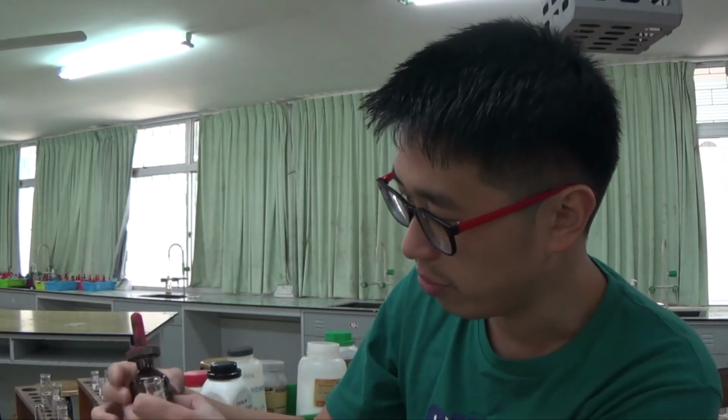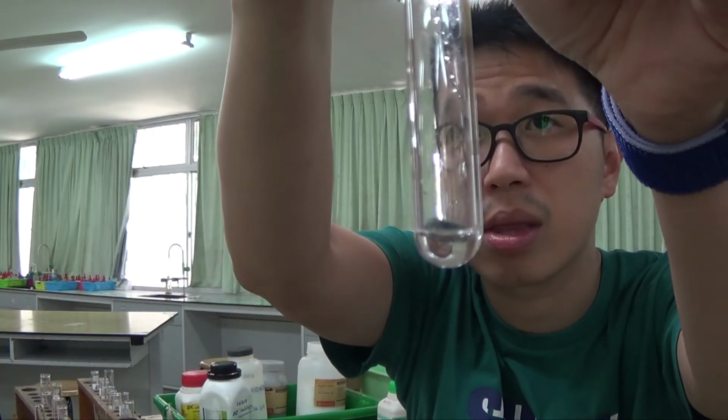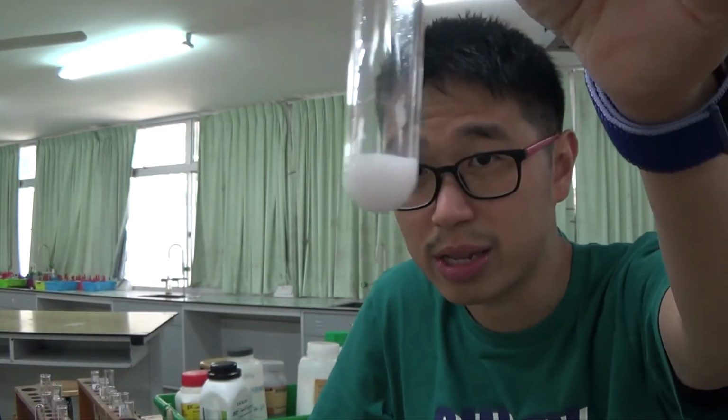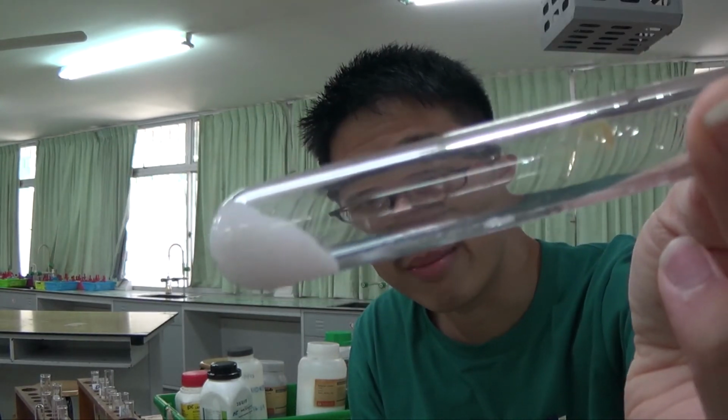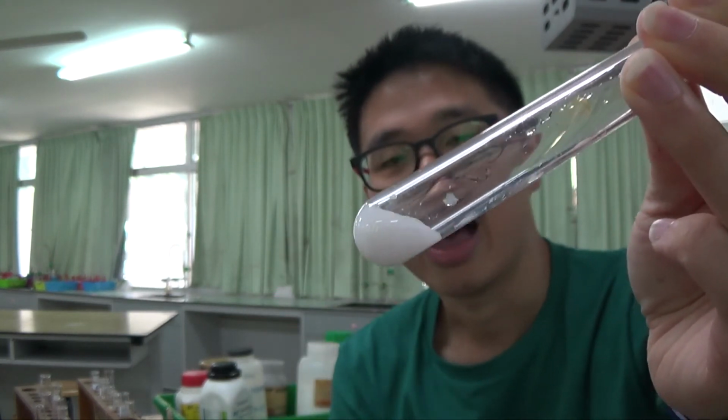Okay, to test for chloride, you use something called silver nitrate. You see, even the label came off a little bit. Silver nitrate stains your hand, because the silver ion gets reduced to silver very easily. It tests for halides: chloride, bromide, iodide. When you add silver nitrate to something that contains chloride, bromide, or iodide, you get a precipitate straight away. The colors of silver chloride and silver bromide are very difficult to differentiate. These are only differentiated in A levels.